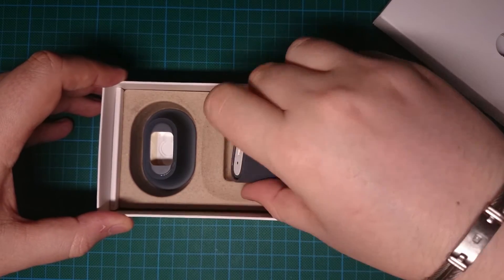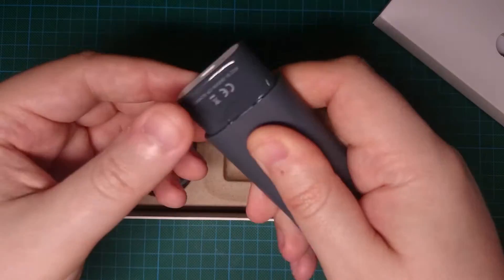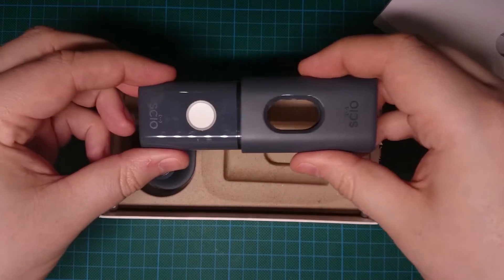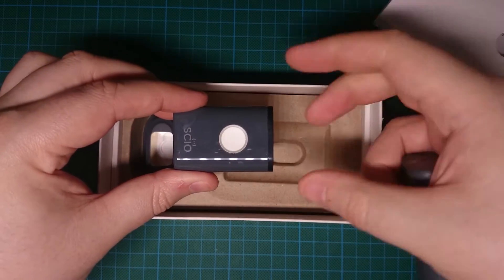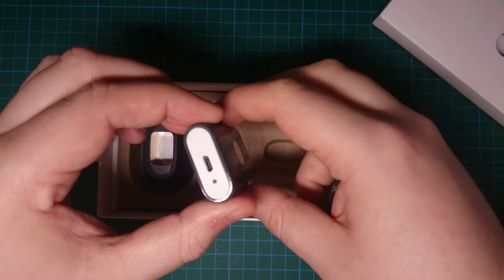So that would be the scanner itself. There's a bit of a scratch here and there, but whatever.